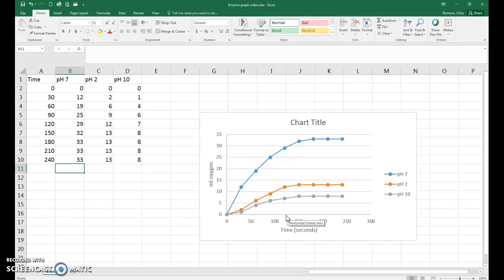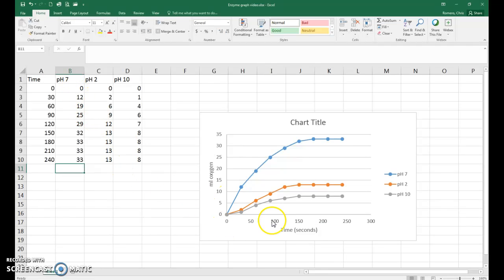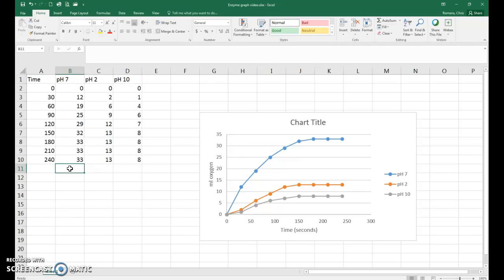What that means is we will only select data from our y-axis that corresponds to 0 to 120 seconds. So you've got your cell clicked right below the data that you're interested in. You're going to go up to where it says FX, the Insert Function button.